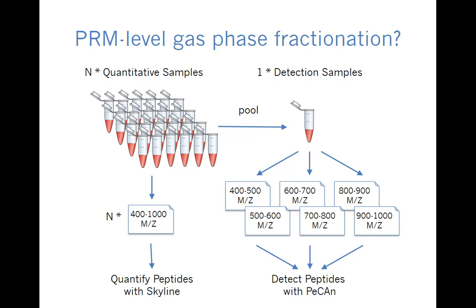So I'm not going to actually teach how you do this because it will require a lot more data than we would want to be able to analyze in 45 minutes, before we're having a break next, so before you get the break. But I just want to put this seed in your mind's eye that it is possible to use a program like this to do very deep level proteomics, even if you're collecting just one acquisition per sample, as long as you create these libraries.